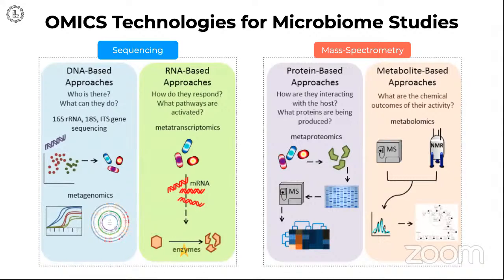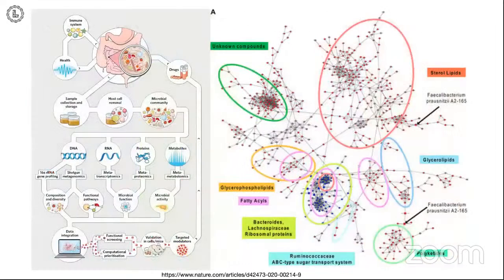So many of these questions are being answered using next-generation sequencing, but also other technologies like mass spectrometry for proteomic and metabolomic data. Indeed, the next phase of microbiome research lies in the ability to integrate multi-omics datasets that combine next-generation sequencing, mass spec, and structural data with phenotypic information about overall changes in microbial communities and the environment that they create.